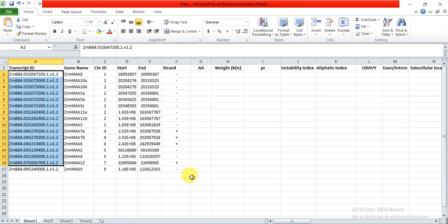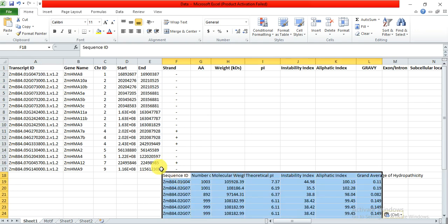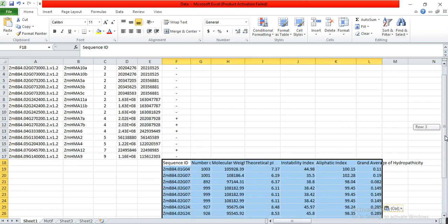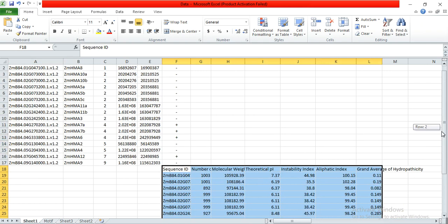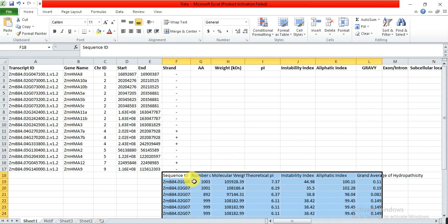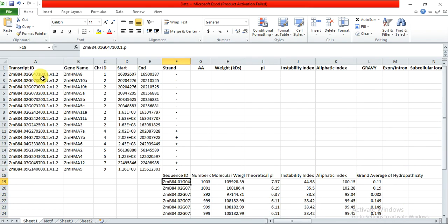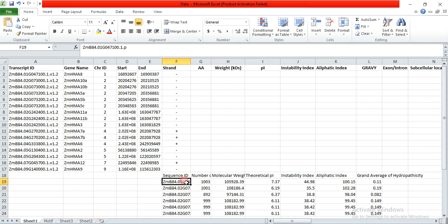When you click OK, the results appear. Select all, copy, open the txt file, and paste the results there. You can double-check — here is a transcript ID, and you can verify it matches. Since I arranged them in sequence, all the IDs are the same. We can now copy the amino acid numbers.